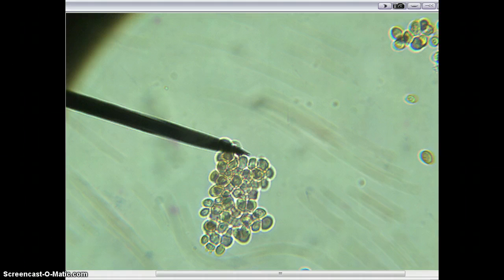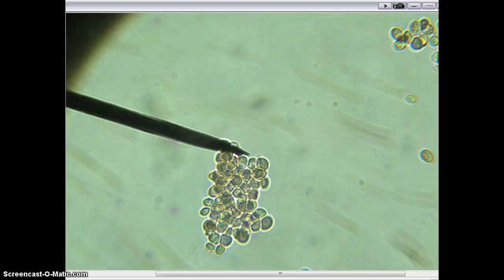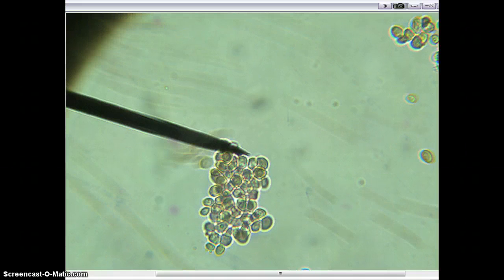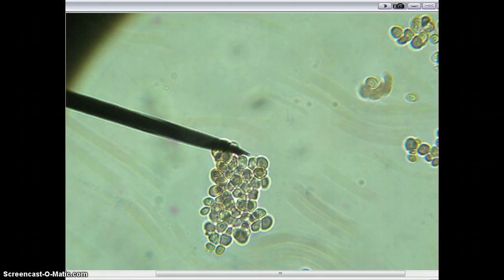Active transport - energy is needed to get the food, the substances inside the cell. So in the slide before, you could see that the living cells had the red stuff inside. The living cells were producing energy, moving things across the membrane by using energy, and that red color, which was mixed in with their food, was going in.